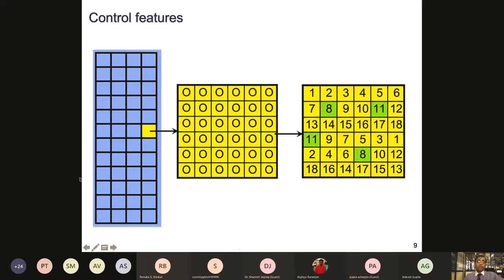So now on one of these slides, you want to print many features, right? Let's say this is one of the blocks, which shows you a layout of 6 by 6. How many features you want to print on this particular block, and you have so many blocks on one slide. Here, in the inset of one of these features, you can print so many genes.